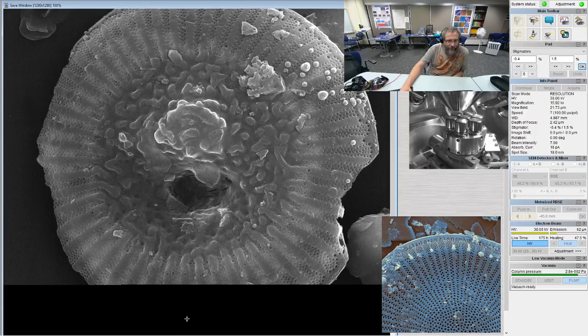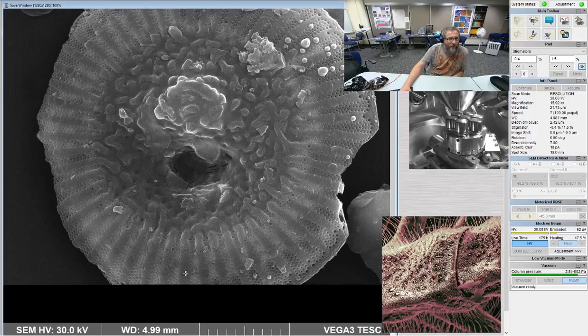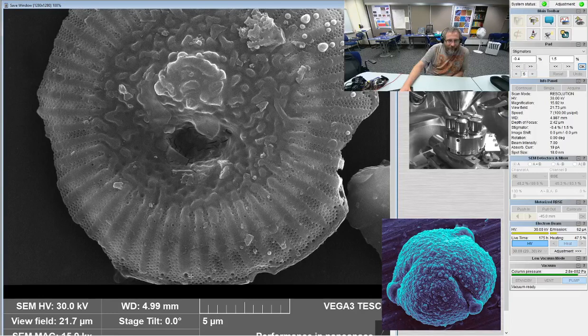axis of the transverse undulation. And I usually see it on the downward depression side. I don't know if that's always the case, but it's a mystery. Aha! Nope. Yeah, I think that's a Rimaportula.